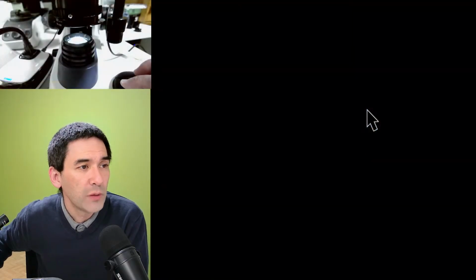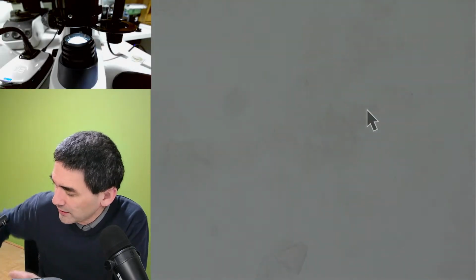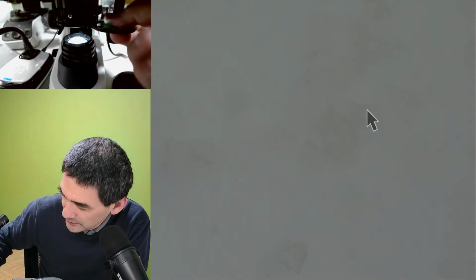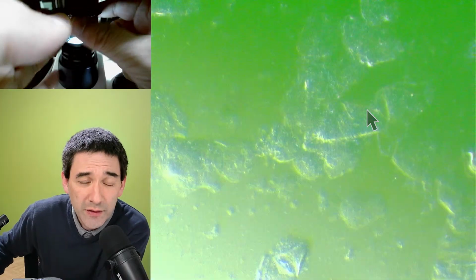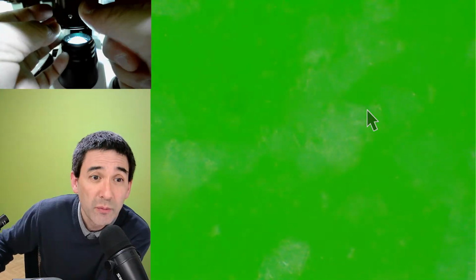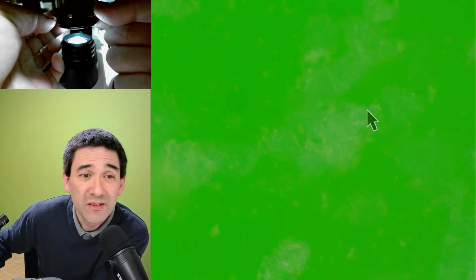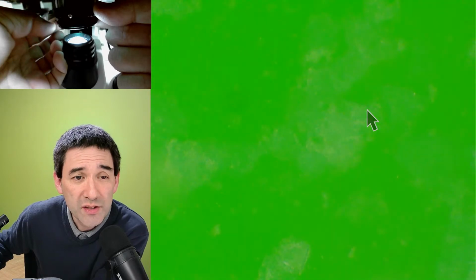So let me do the following. I have not tried that either. Let me see how this actually looks if I put in the green. Nope, now everything's green. Let me see when I open it. You see, it's barely visible. The contrast is too low.